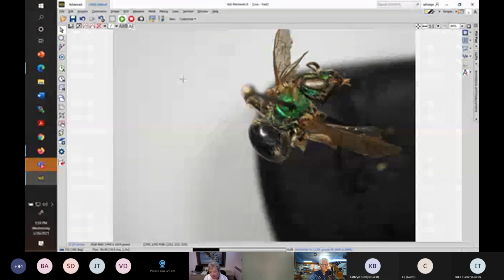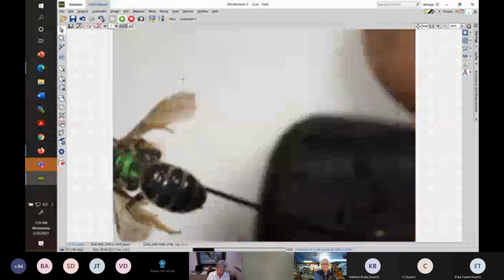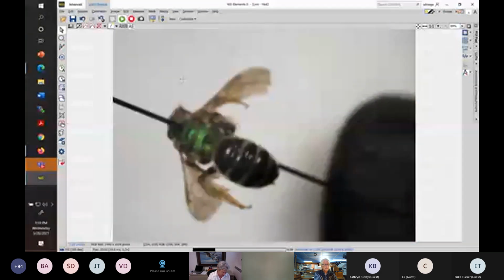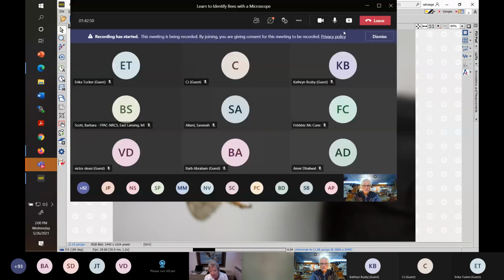Okay, last call for questions that need the microscope or the key open. Cool. So Sam, will you stop sharing your screen? There are people who would like to see your method of measuring a bee with the ruler. All right. Have I stopped sharing? You have stopped sharing.